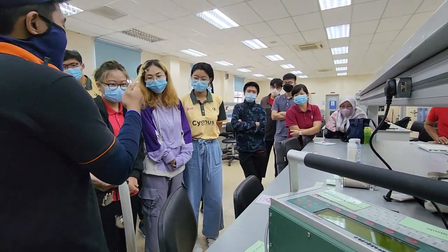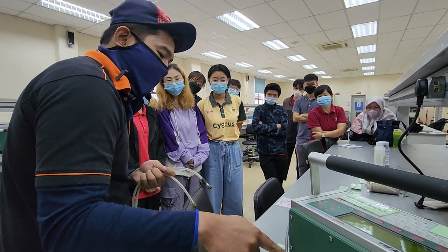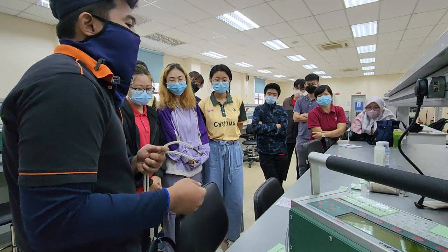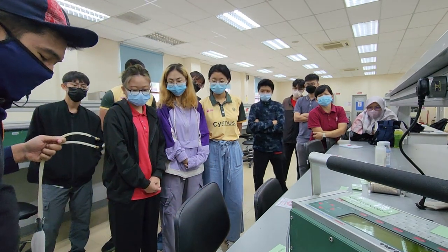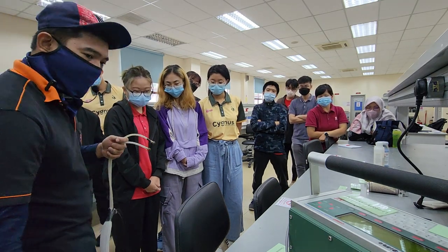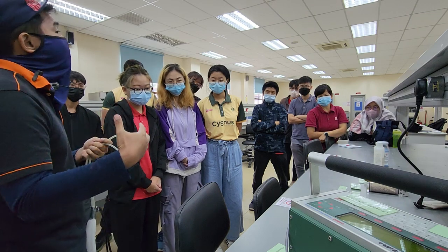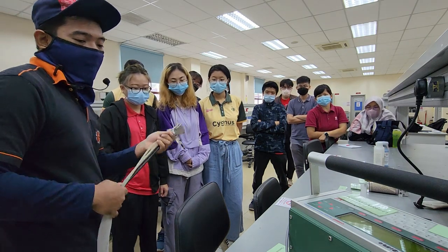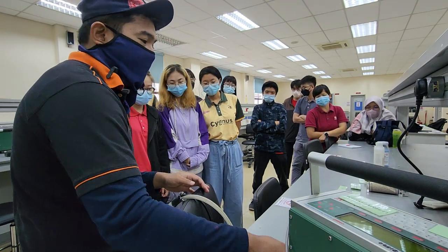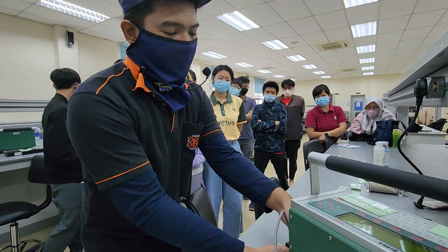And then you have your gas cable. You see the little black band surrounding this cable. You need to find the equivalent, because it is for the sample gas. Sample gas is the gas which has been used by your plant, so that the machine can analyze it. Reference is the gas given to your plants so that they can photosynthesize. At the bottom here you have two slots. This thing that looks like a brick here is actually the battery. I'll just open this.